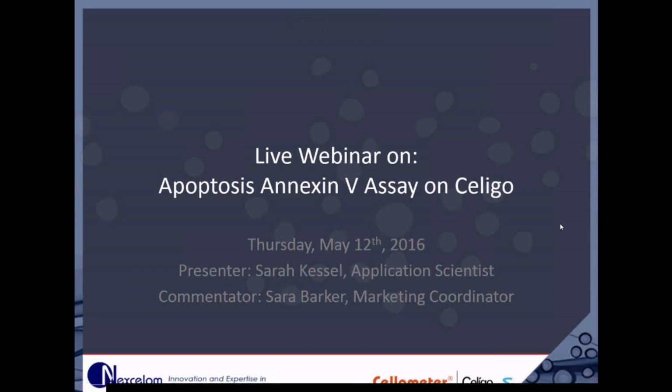Alternatively, if you don't want to have that lesser number of wells, I might recommend you move into a 384 well plate. I know it's a little bit daunting to think about pipetting into that. Another potential option is to do a 96 well half area, because those tend to have less issues. We're going to look into that type of plate to see how well it performs in the outer ring compared to the rest of the plate. Okay.